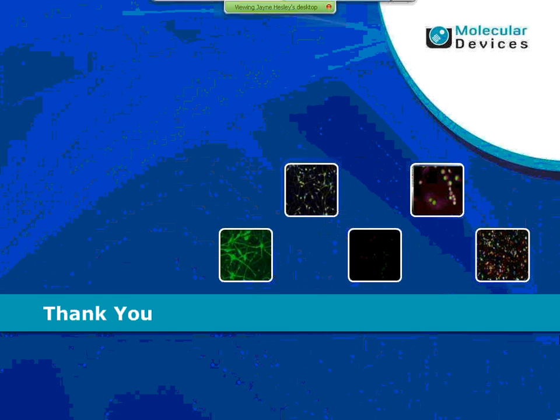Compared to each other, I think you probably get very similar results. I've seen the calcein AM stains the neurite outgrowth very well, and the beta-tubulin certainly does. We have bought a directly labeled beta-tubulin, Alexa Fluor 488, that works very well. It gives you much less wash death when you don't have to add the secondary antibody.